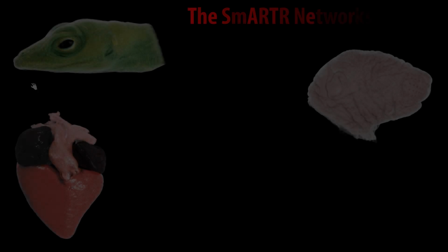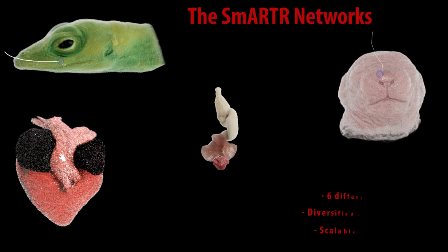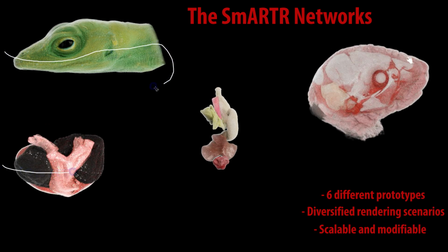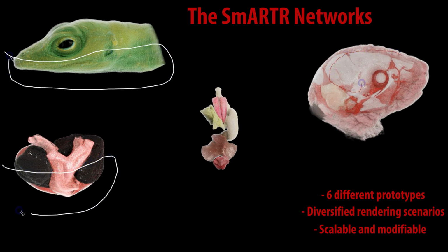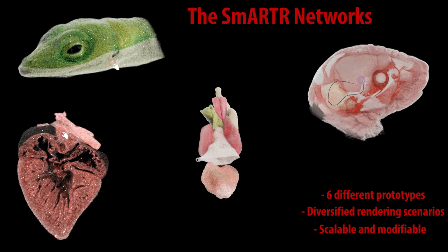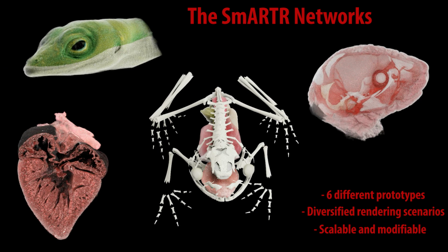Multiple software configurations, the SmARTR networks, have been prototyped, offering a wide range of visualizations. Although developed with a specific rendering scenario in mind, the modular design of the SmARTR networks allows for modifications and expansions to meet specific end users' visualization needs.